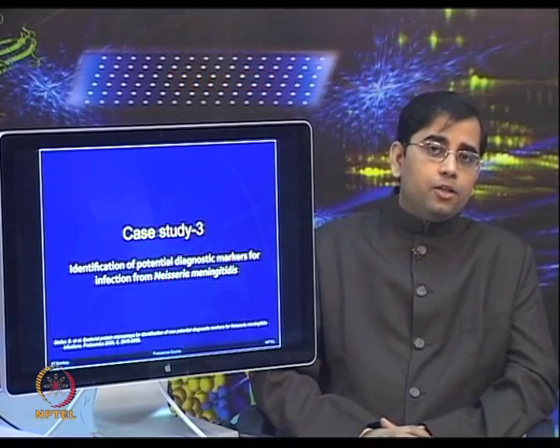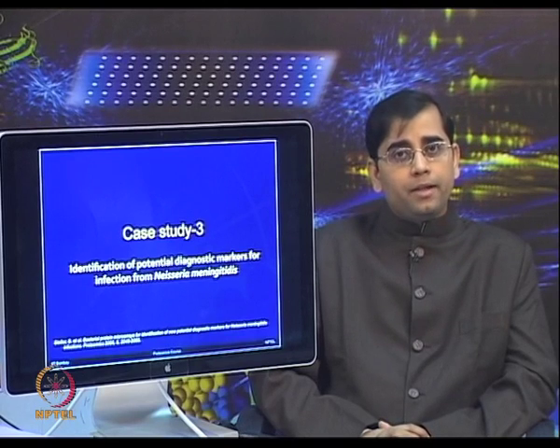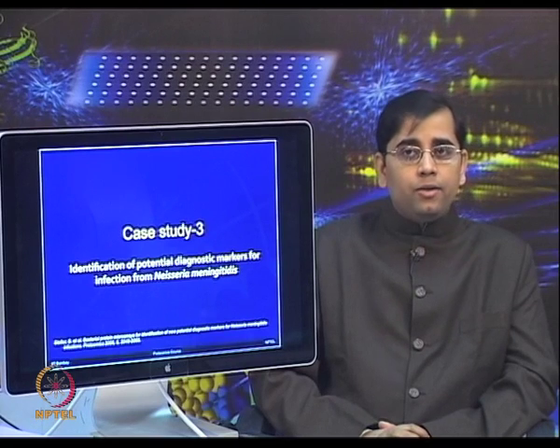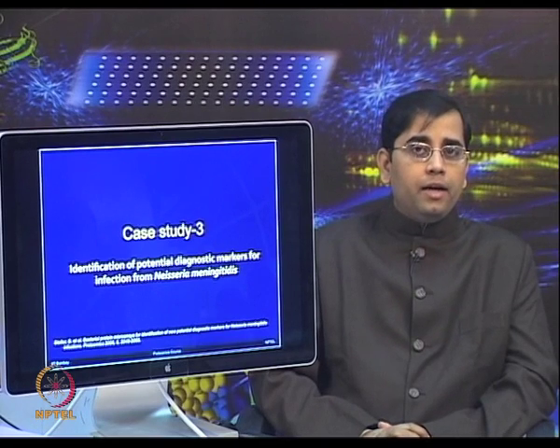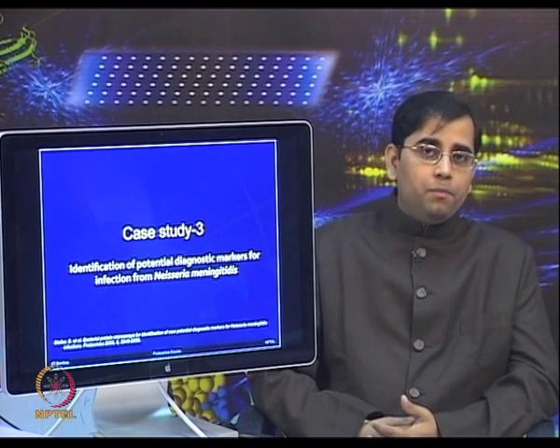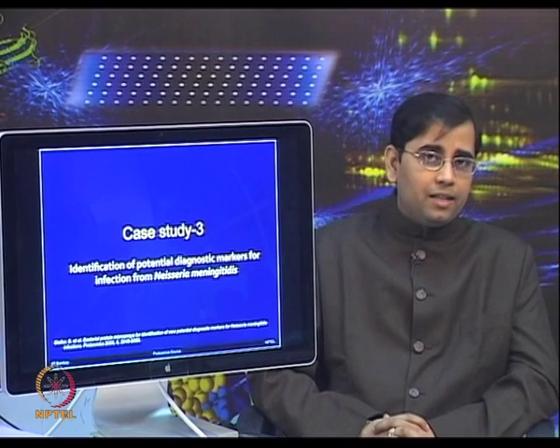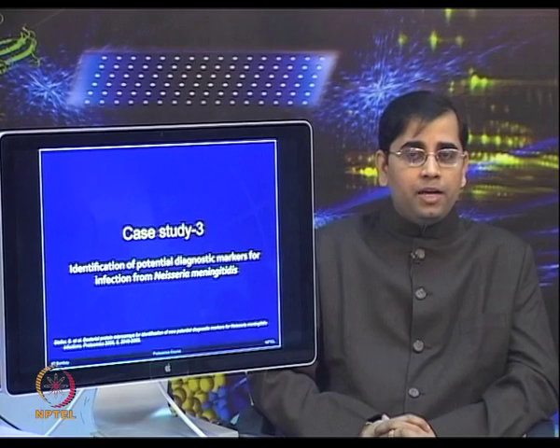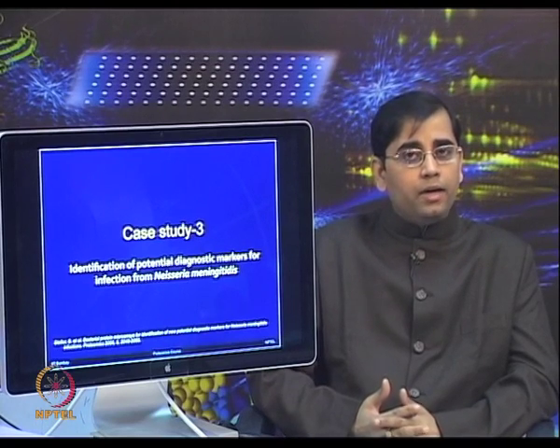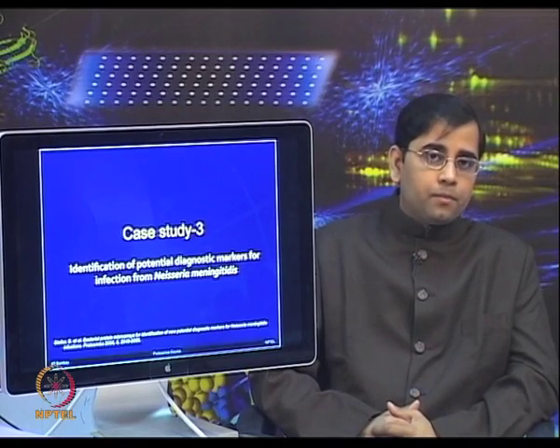After studying two applications, one based on human proteome chips, another based on E. coli proteome chips, now let us look at some of the biomarker discovery in a quicker way, just so that we have more time for looking at other types of applications. So, I will try to cover some of these applications in brief, just to give you an overview of different types of applications that happened on these protein microarrays.